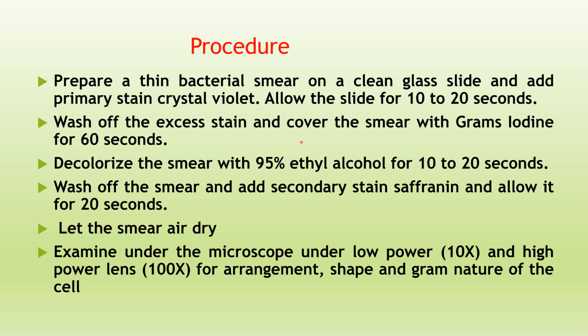So this is the second step. In the first step, we are adding the primary stain. We are leaving it for 20 seconds and then we are adding the Gram's iodine. Gram's iodine addition leads to the formation of the crystal violet iodine complex, as we have discussed before, and we need to give 60 seconds.